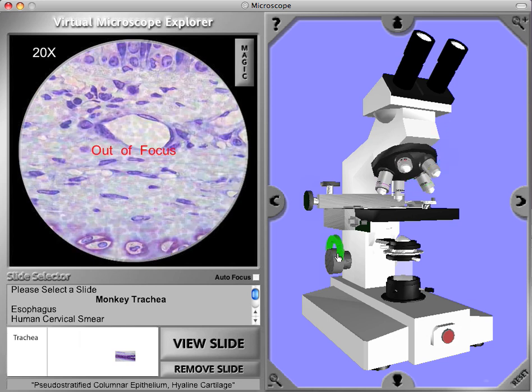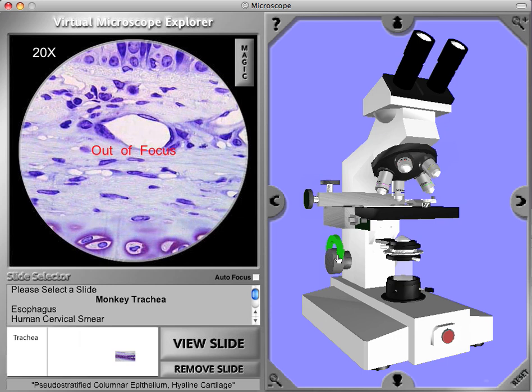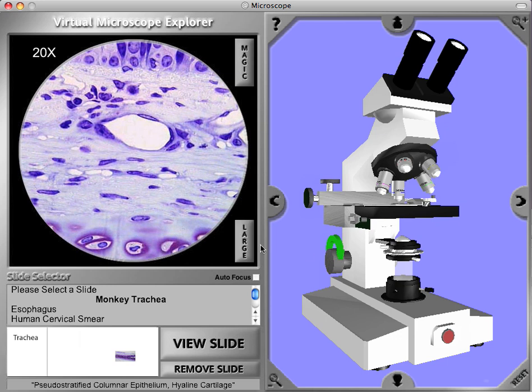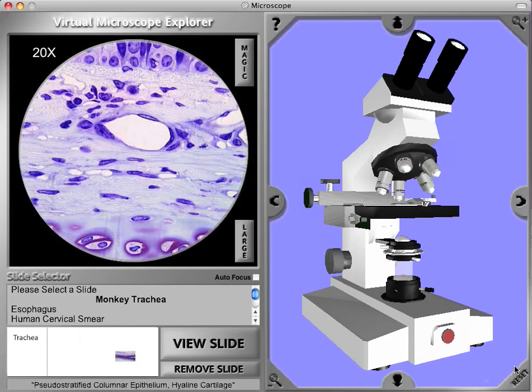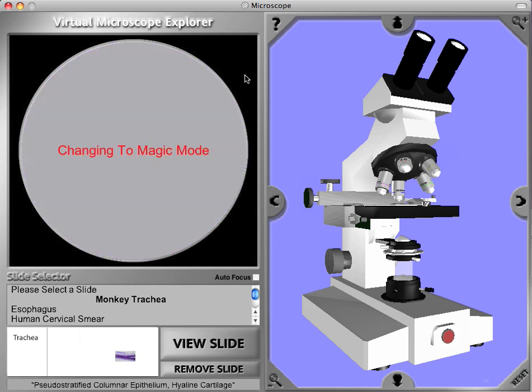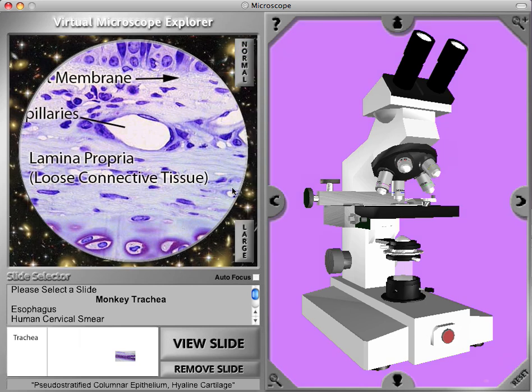Now when it's in focus, we can view the image with the large mode where we see the whole thing. Now we see a lot more detail than we did at the low power. Again, we can look at the magic mode where the salient features of this image are labeled.